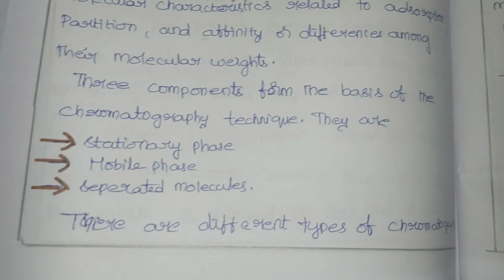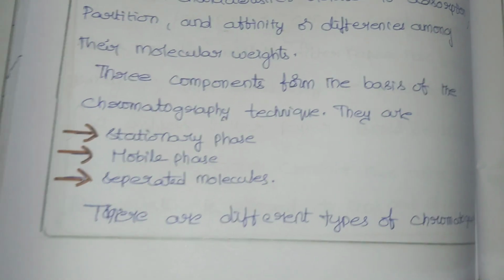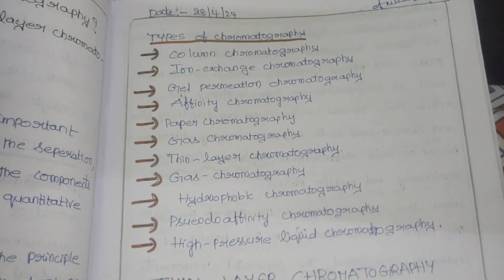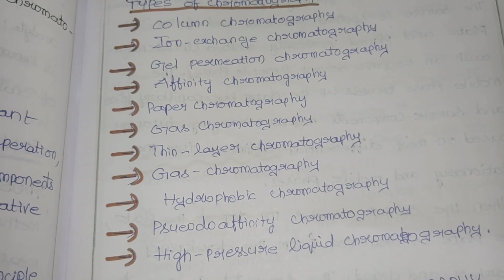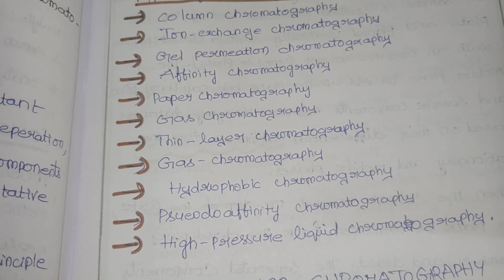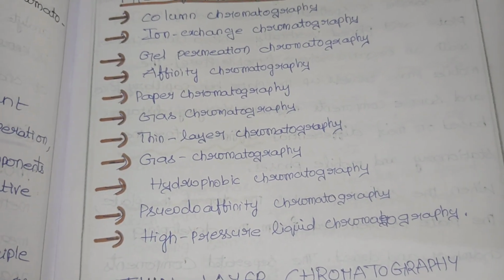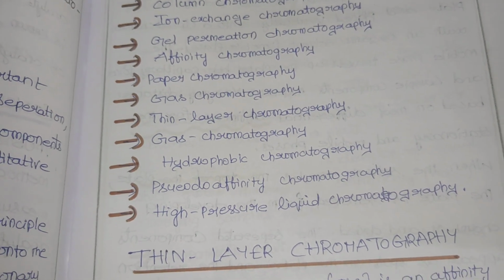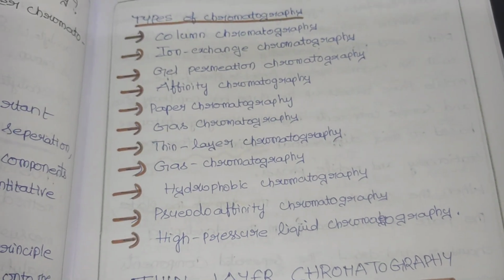What are they? I already told you there are two phases, the stationary phase and the mobile phase, and after that the separated molecules. There are different types of chromatography, like column chromatography, ion exchange, gel permeation chromatography, affinity chromatography, paper chromatography, gas chromatography, thin layer chromatography, hydrophobic chromatography, pseudo affinity chromatography, high pressure liquid chromatography. So many different chromatography techniques are there.